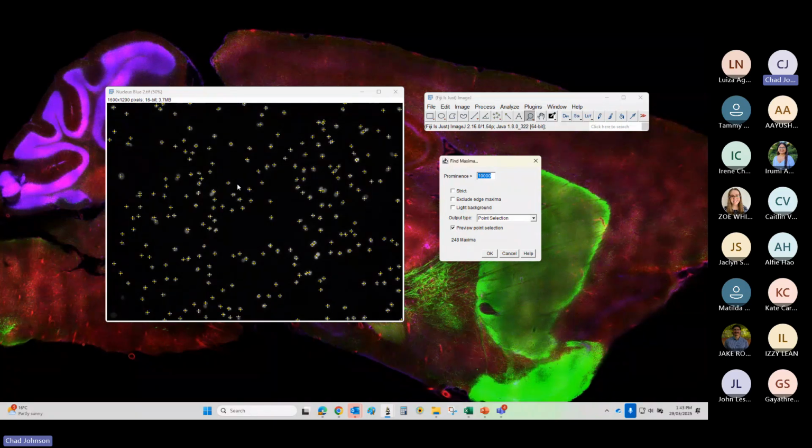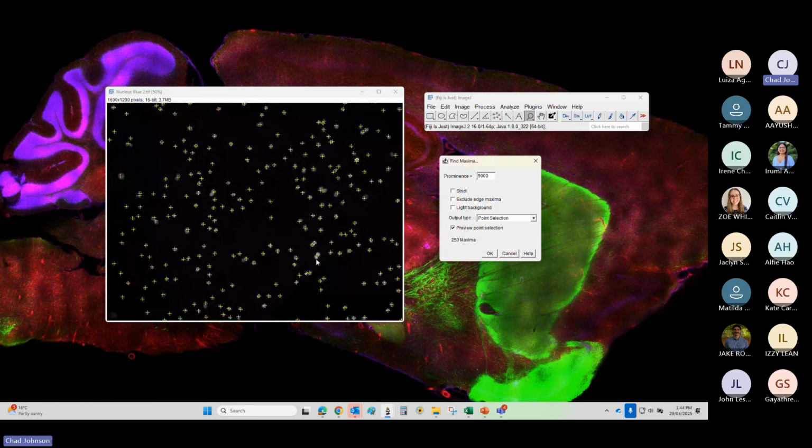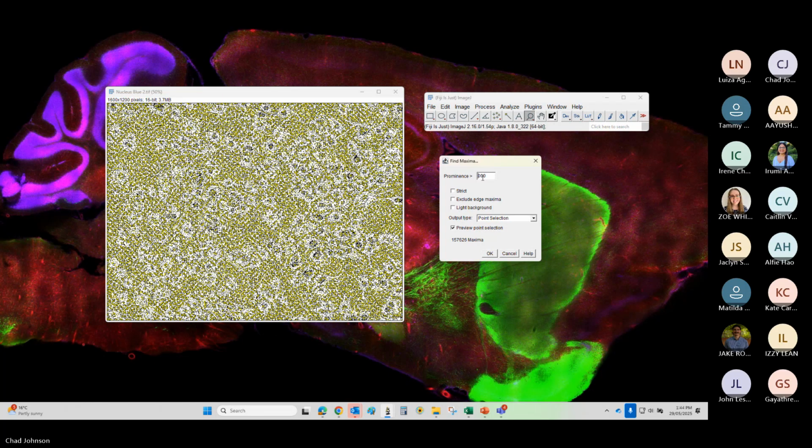That's pretty good. I'm pretty happy with that. I might go a little bit higher. Maybe 11. No, that's too high. So 10,000 is pretty good. So I've even lower actually. Let's go 9. I'm looking at this guy. So he's obviously 2 nuclei, but he's only got 1 spot. There we go.